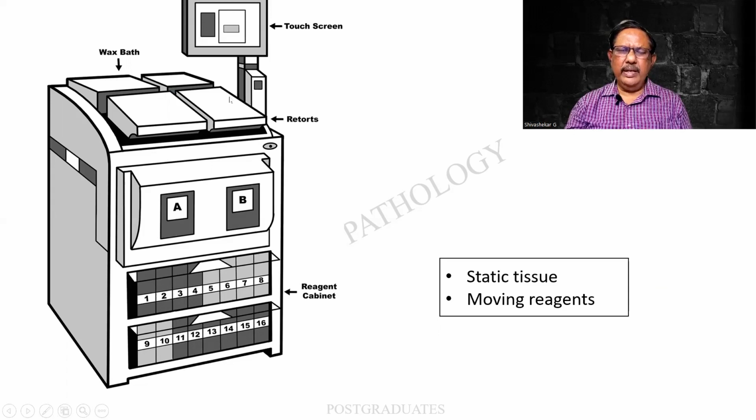This is the master screen by which we will be able to manipulate and change. It's a touch screen by which you can operate, just like your cell phone. And these are the various reagent cabinets from which we will see how it goes into the tissue as such. Now, there is a difference.